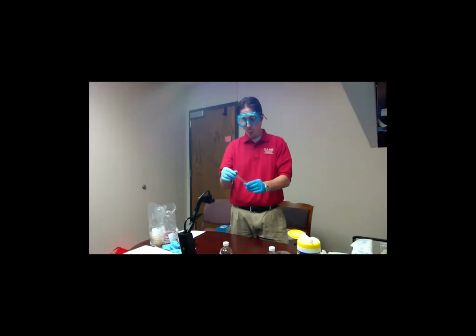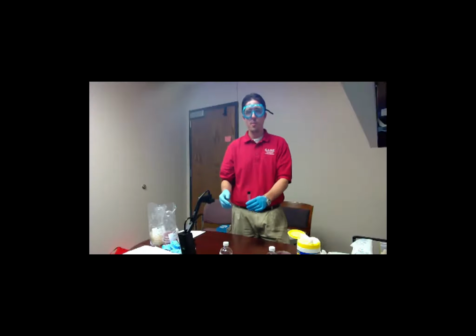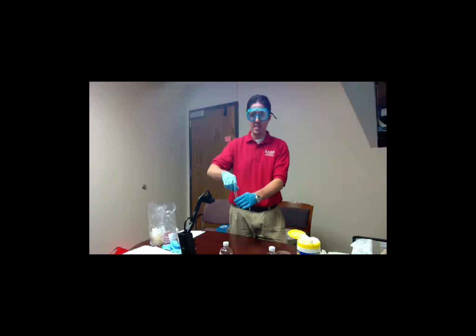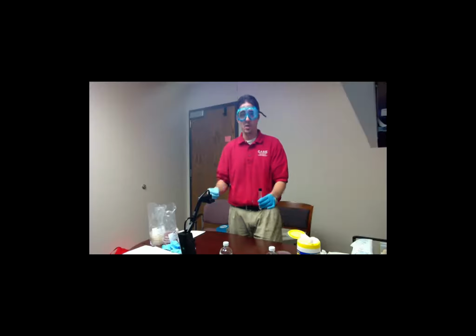So once you get back to the classroom, even if it's going to be a couple hours before, if you put this in a test tube holder or prop it up some other way, it is suggested that you just slightly unscrew the cap, leave it on there, just let it be loose until you're ready to use the sample.